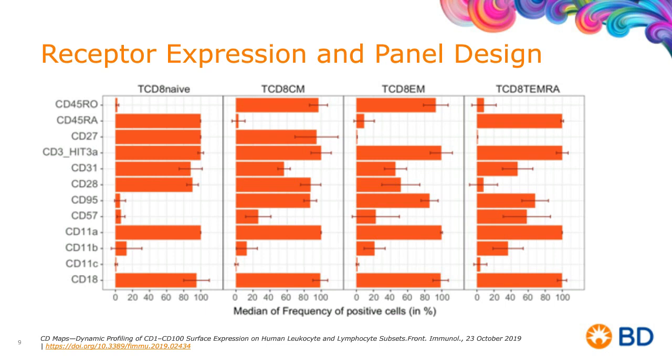So this paper is a fundamental paper, and I think that everyone should have a copy and look at it and read it very carefully and look at the database of specificities. This team that built this paper actually is a sub-team out of our HLDA that has given us all of our CDs for human immunology. And it was their idea to expand on all those CDs and to give us more pertinent information about how to use them, especially in flow.